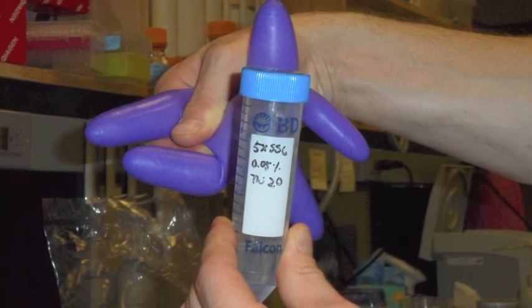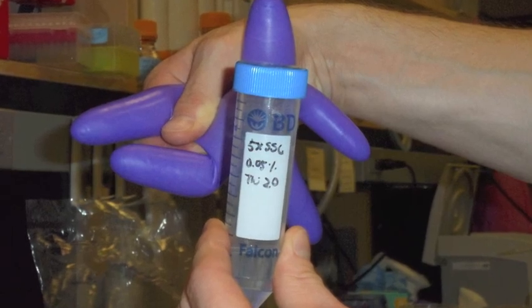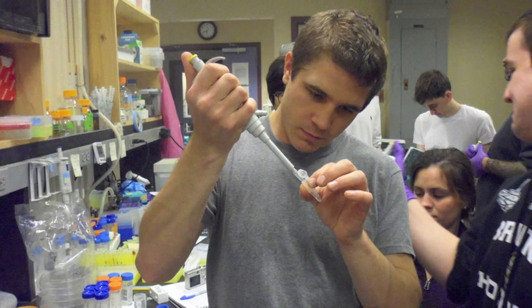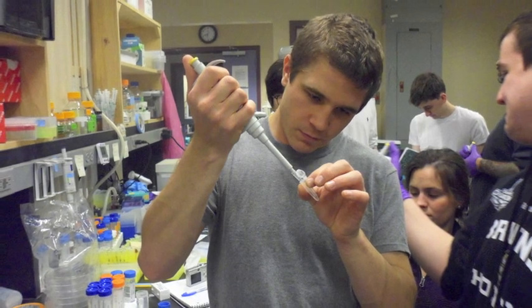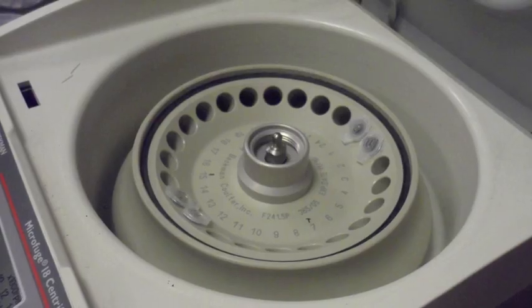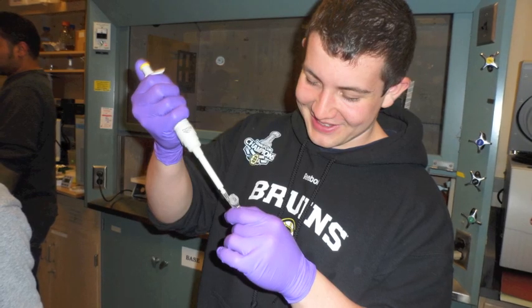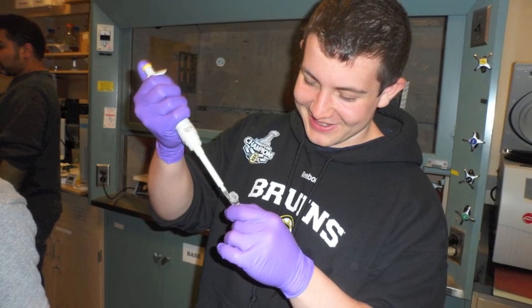Next, using 5X SSC, a standard sodium citrate buffer, wash the microparticle solutions three times. This removes unbound DNA. Remove the supernatant by centrifuging in between washings, being sure to lose as few microparticles as possible.